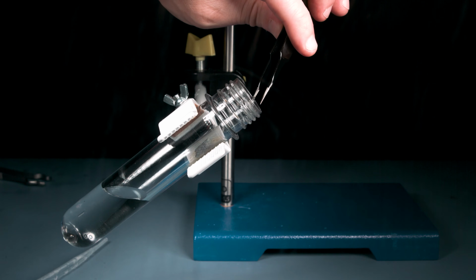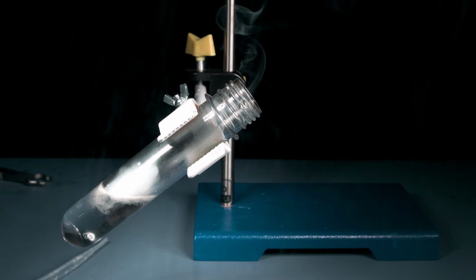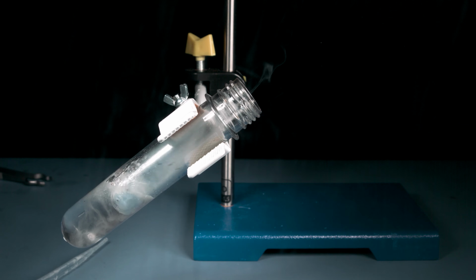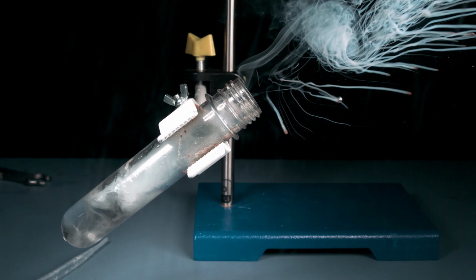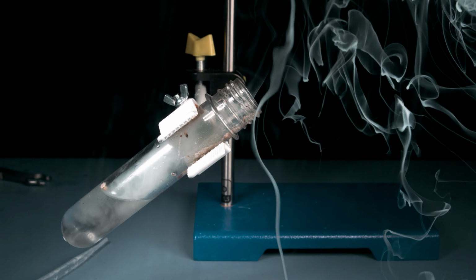Now here is a test tube. I'm dropping some potassium into the water. You'll see that it begins to react immediately and starts to produce hydrogen gas. And when I speed up time a little bit, you'll see in real time how fast it's actually producing a lot of hydrogen gas. If that gas is burning down there, which is possible, then it's with a transparent flame because I couldn't pick it up on the camera. Eventually, it reaches a critical point and then it begins to explode and shoot the molten potassium out of the end of the test tube. And if you look closely, you can see that those molten bits are glowing, yellowish, kind of like amber colored. And it's over in a second.